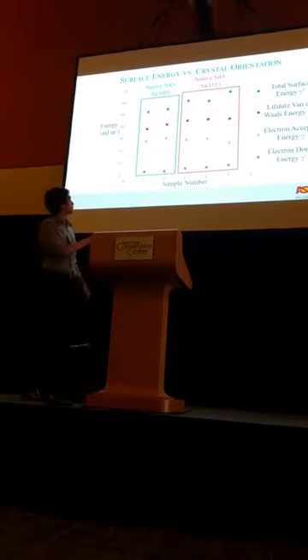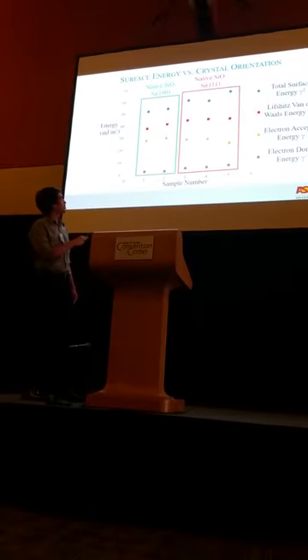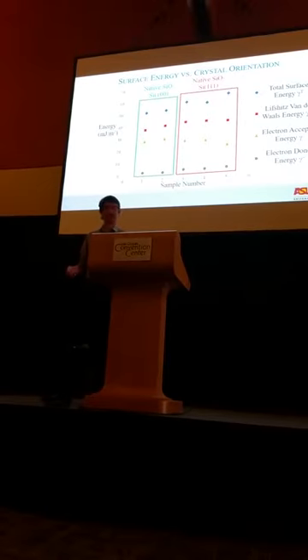So here we have a graph of our results with our standard deviations. You can see that our standard deviations are very small. We can also see from this graph that the surface energy of our silicon 111 is much higher than our silicon 100 crystal. So we can gather from this that silicon 111 is more hydrophilic than silicon 100.